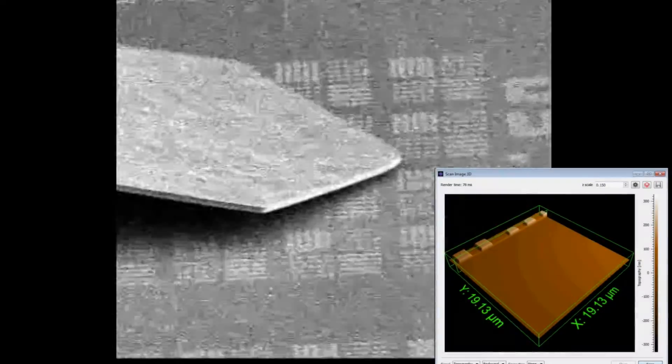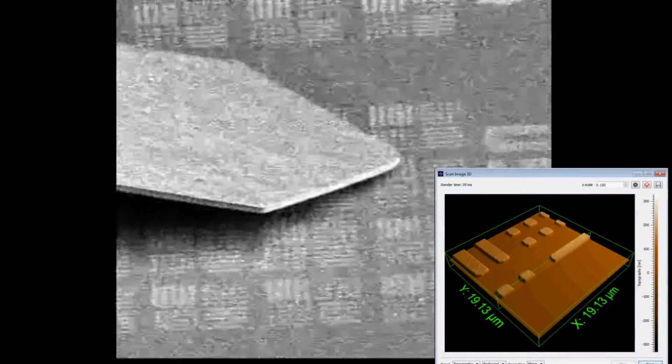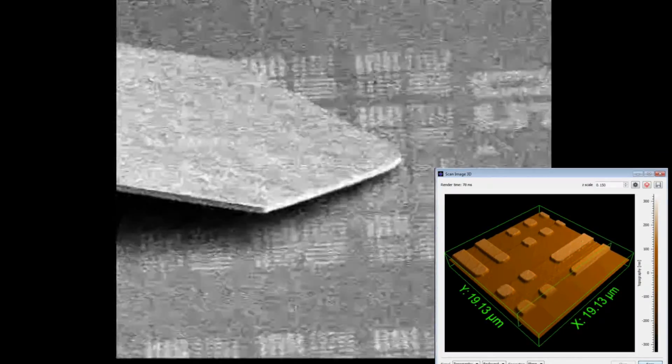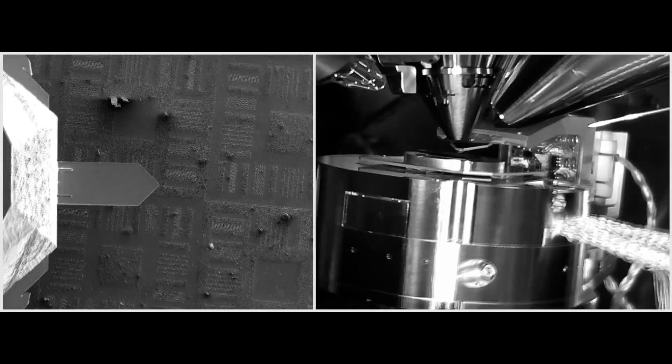We can collect different data from the AFM system like topography, amplitude, phase, frequency shift, error and overlap them on the images coming from the SEM.